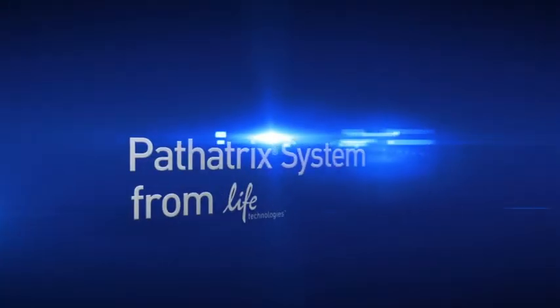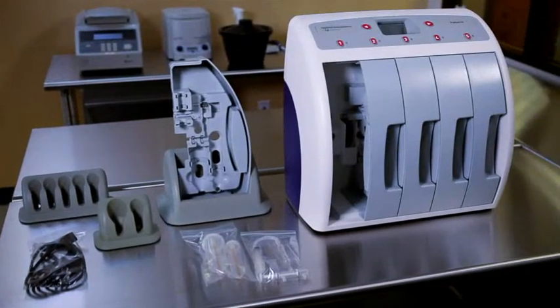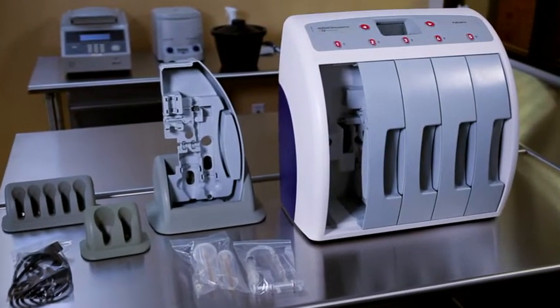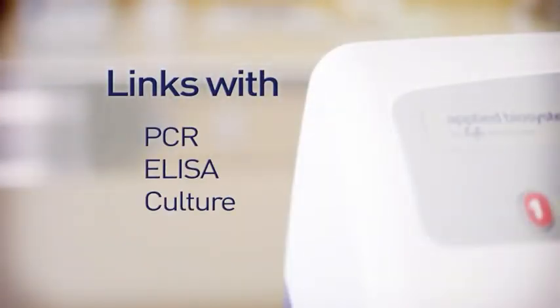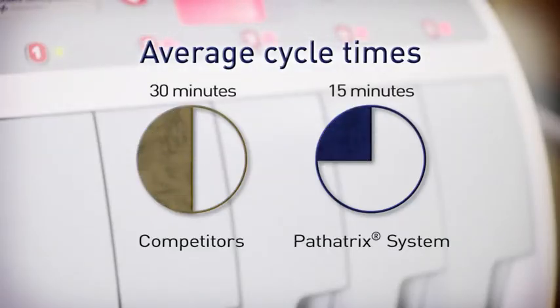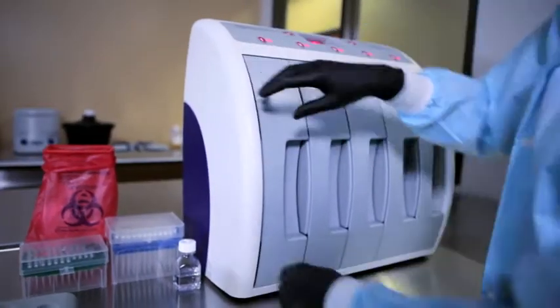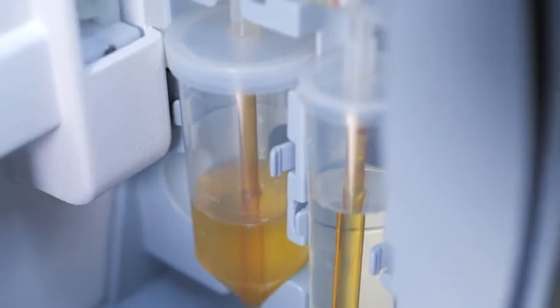The Pathatrix Auto Immunomagnetic Separation System delivers. Our high-volume, fully automated system minimizes the chance for human error and links with any detection system. Because it can test larger samples at one time and has a shorter run sequence, you can rely on the Pathatrix system to increase your productivity and help save you time and money while meeting exceptional food safety standards.